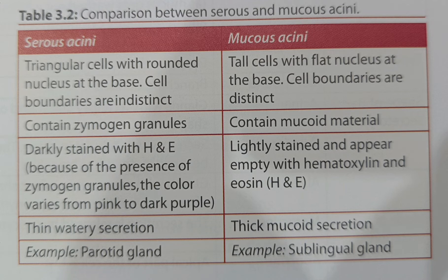The characteristic feature of serous acini is darkly stained with H&E, because of the presence of zymogen granules. The color varies from pink to dark purple. The secretion is thin and watery in serous acini, with triangular cells having a rounded nucleus at the base. Cell boundaries are indistinct.